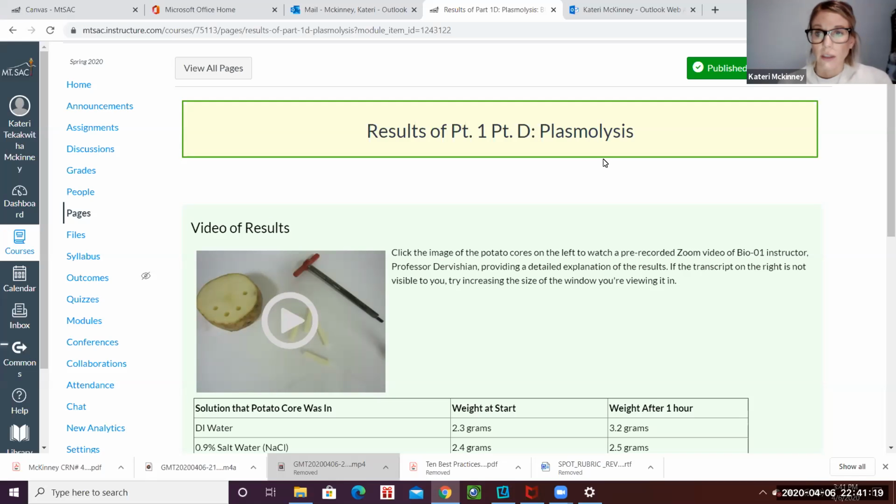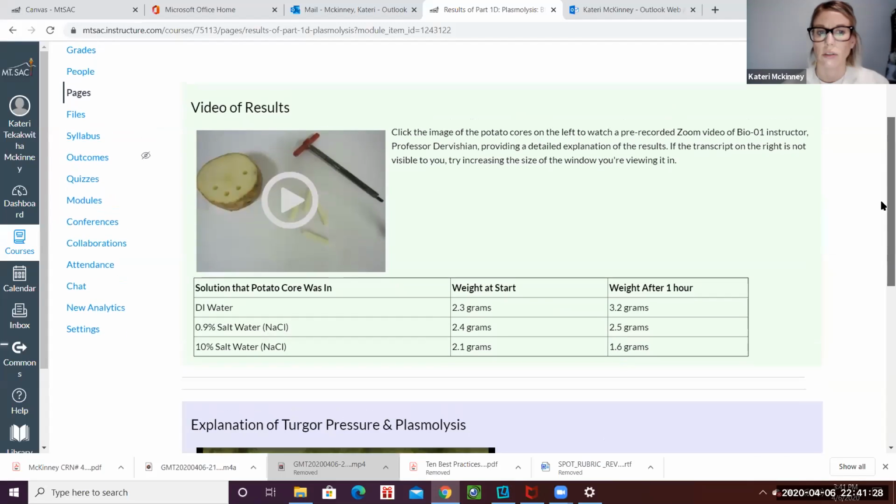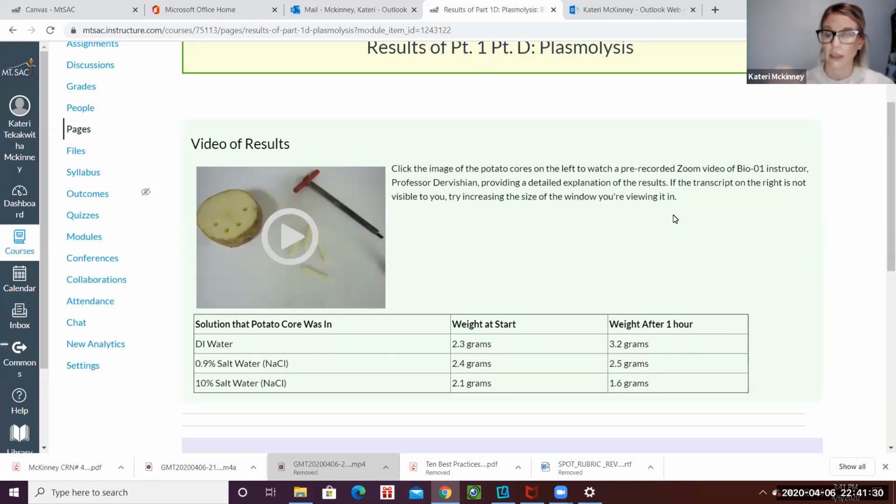So for this part of the lab, which is the results of part one, part D plasmolysis, you would have taken three different, or four different, cores. I think it's three different cores of potatoes. You would have taken potato pieces again, like we did in exercise number 2, and stuck them in tubes. And the tubes would have had different solutions in them.